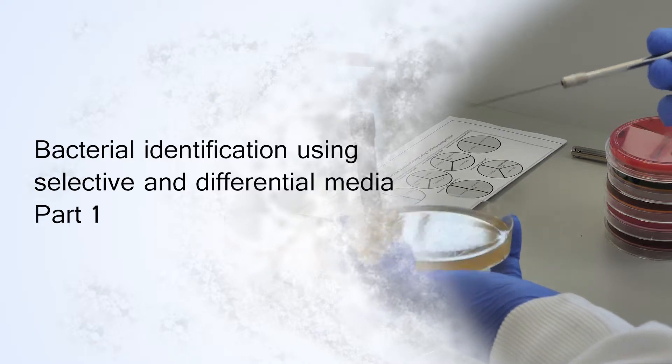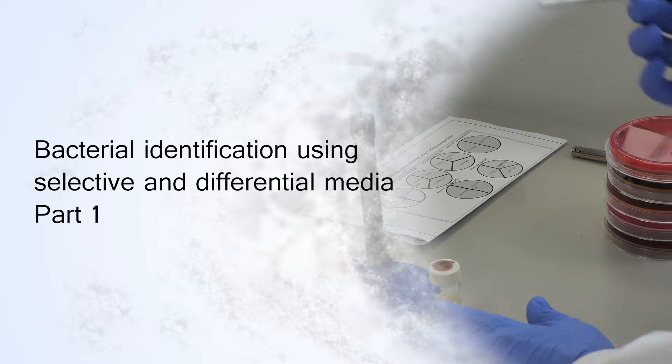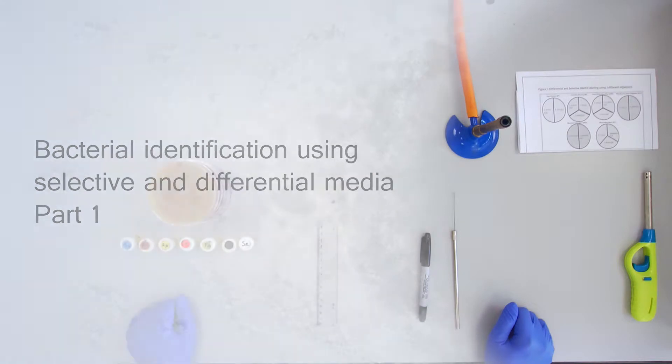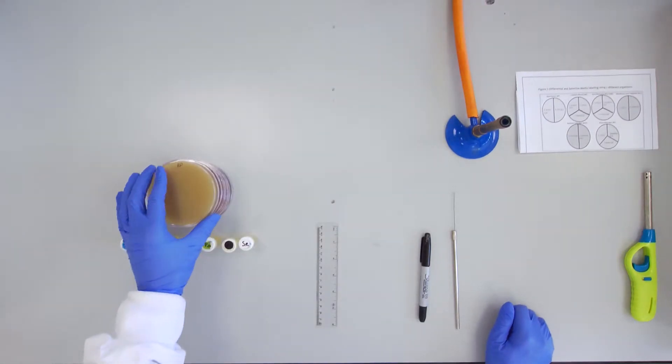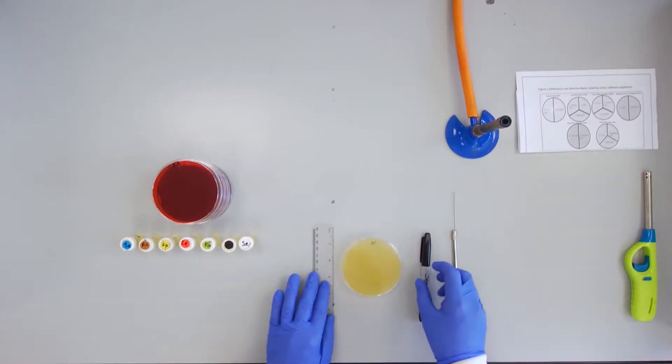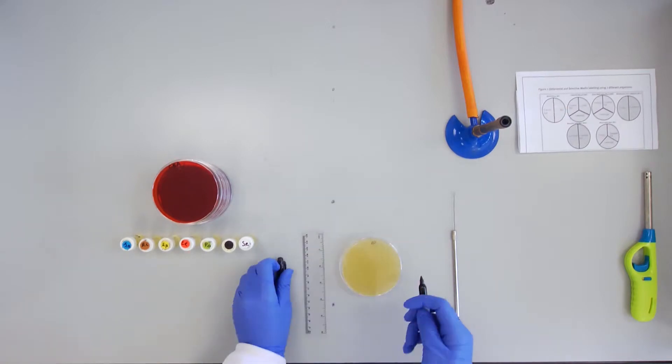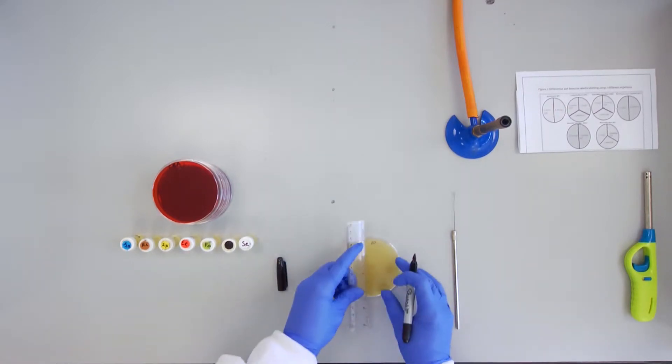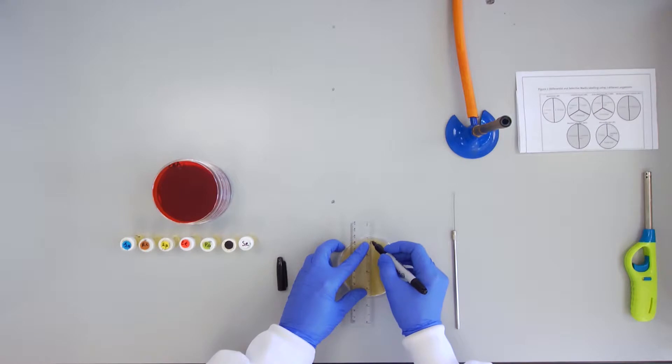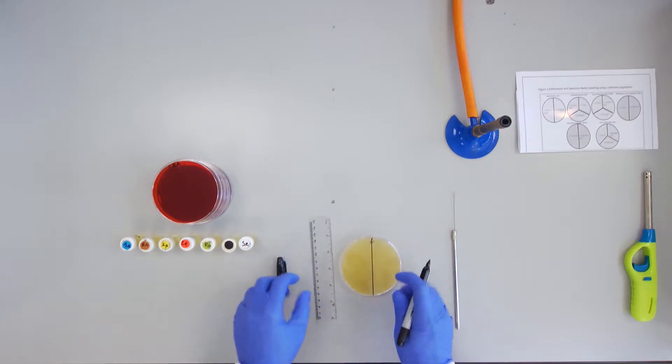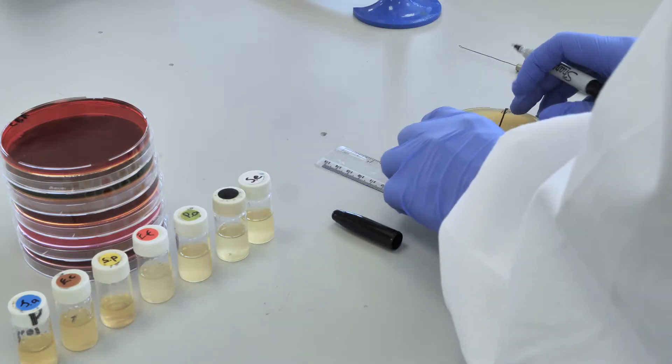In this experiment we investigate a selection of selective and differential media available. The key to success with this experiment is good labeling, organization, concentration, and of course good aseptic technique.